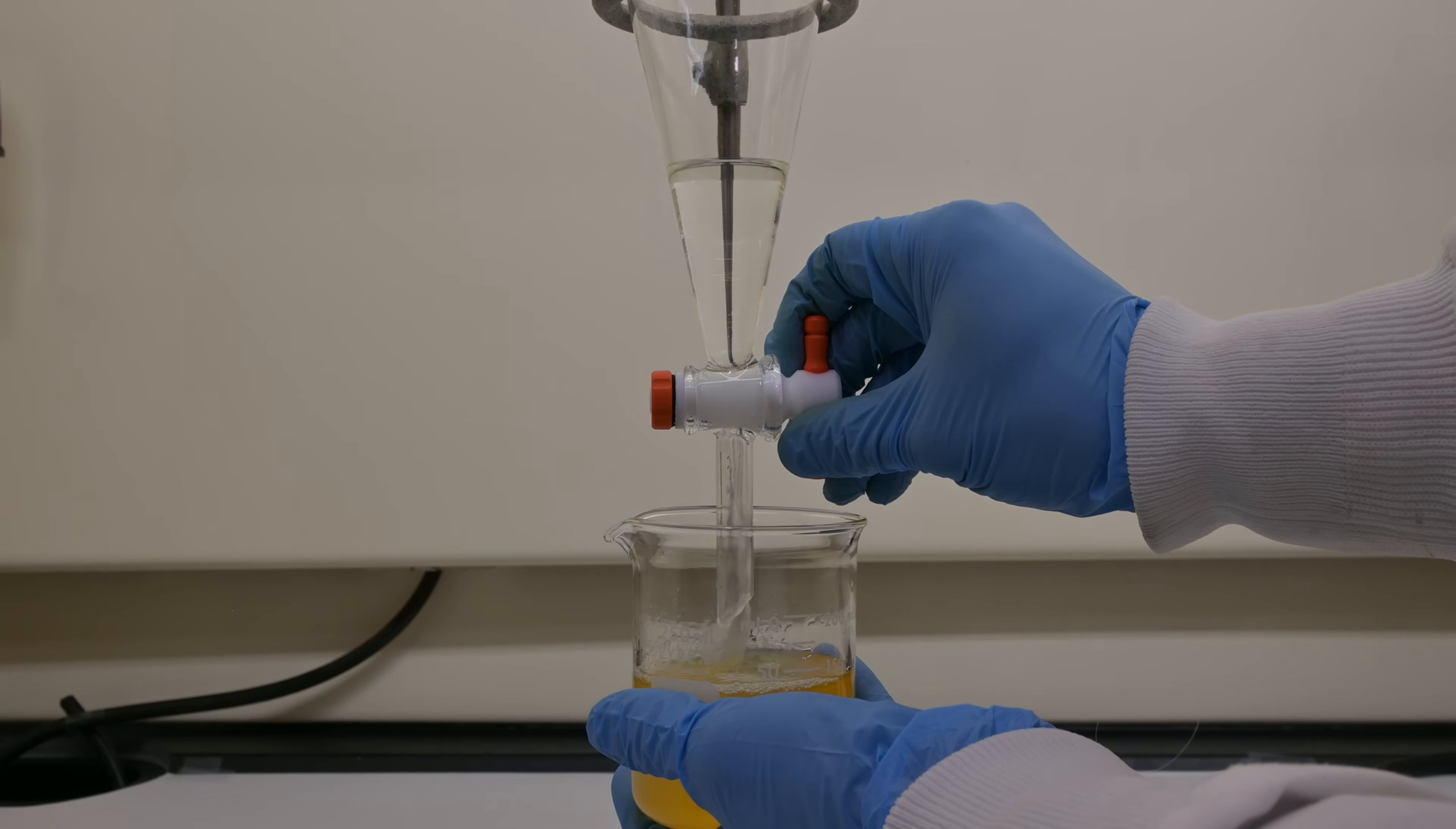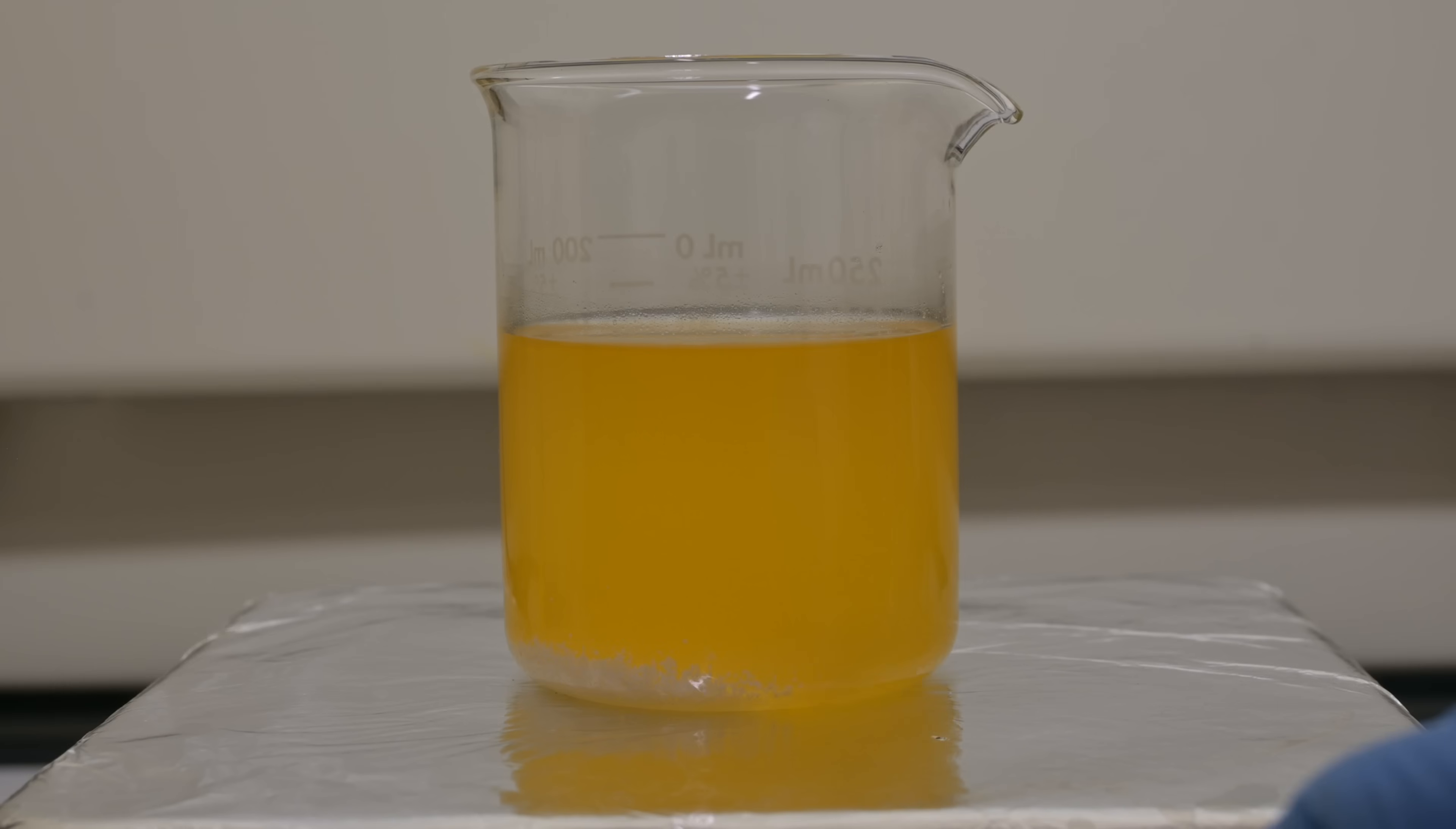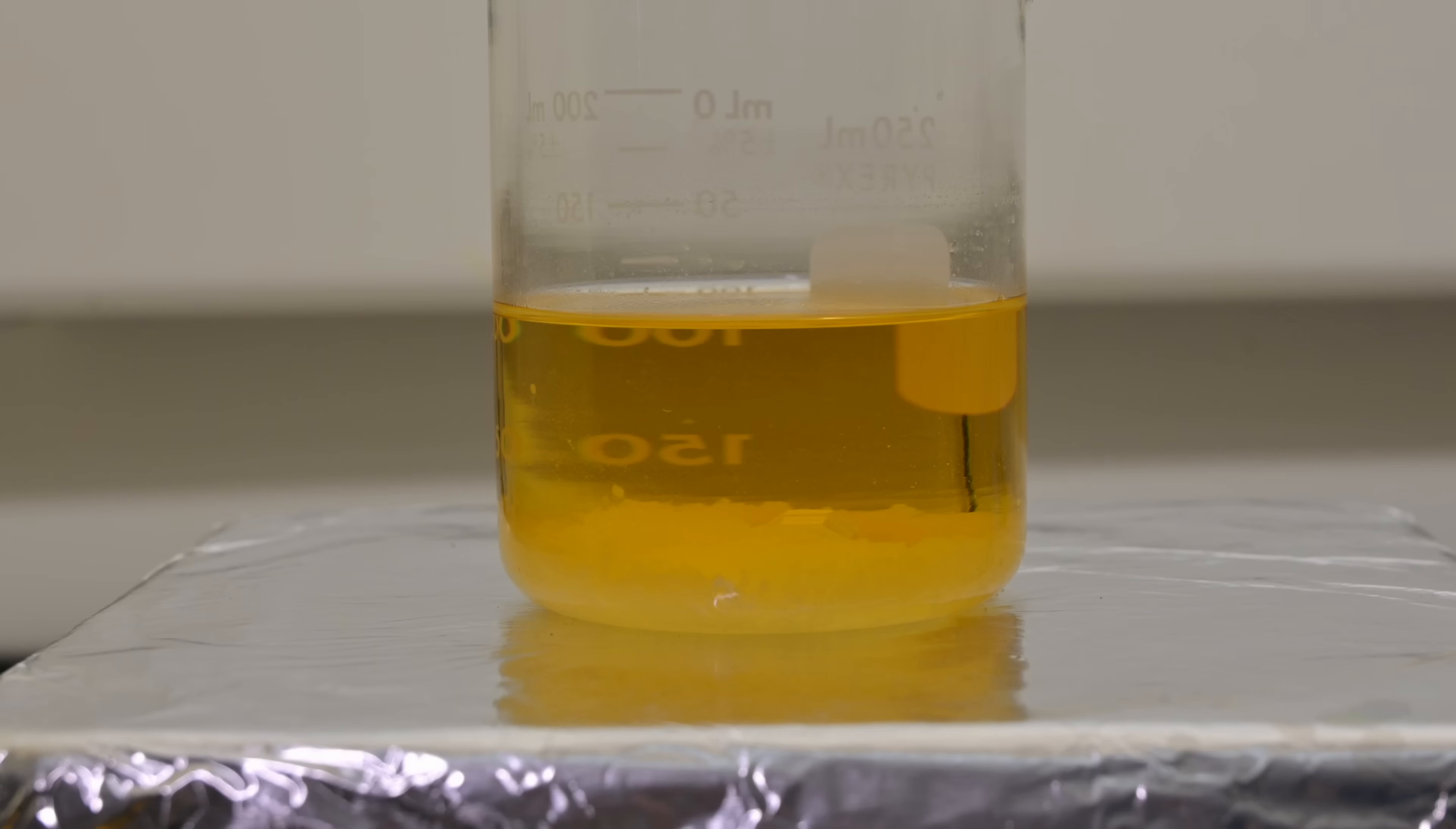I combine all benzene extractions and dry the pooled solution over about 10 grams of potassium carbonate. Potassium carbonate absorbs any residual water and neutralizes trace acids. I stir the mixture mechanically until the solution becomes completely clear. This tells me that the drying is complete. Now it's time to distill.